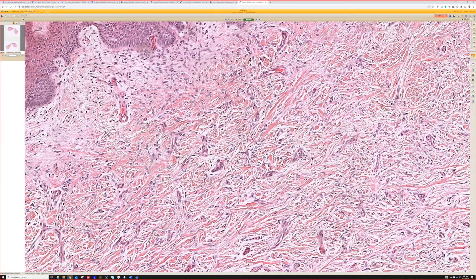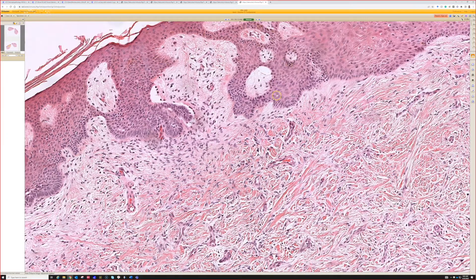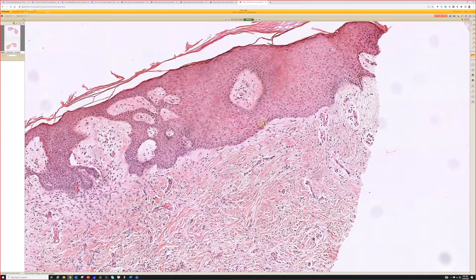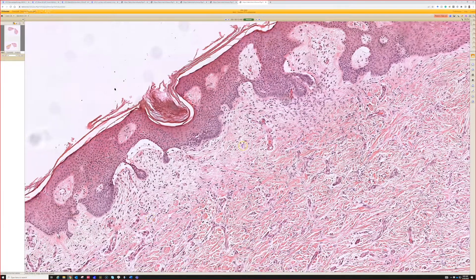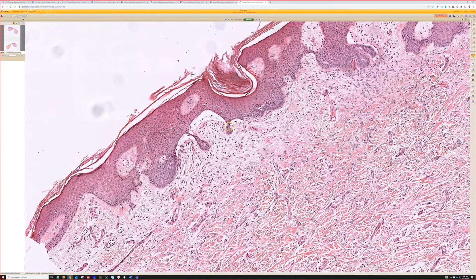One of the best clues to this form of dermatofibroma is if you see the epidermal changes: the hyperplasia, the elongated, flattened, blunted, tabled reedy appearance, the basaloid follicular induction change — all of that. And when you start to see some mucinous stroma and clefting, you can even begin to wonder if we could be dealing with actual basal cell carcinoma.